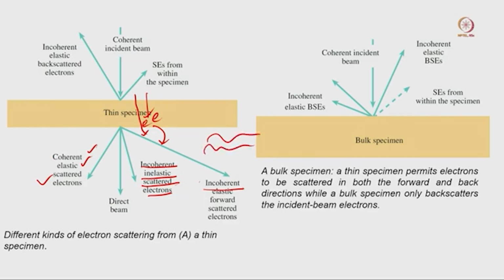So here you can see why some electron beams are incoherent and some are coherent, why some are elastically scattered and some are inelastically scattered. When there is a thick sample, similar phenomena occur: elastically or inelastically scattered electron beams, and coherent and incoherent beams. So we have to consider all of these things when we think about image formation, and with biological science samples, always remember that.